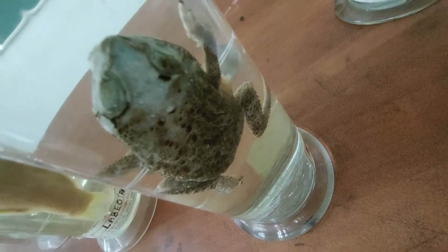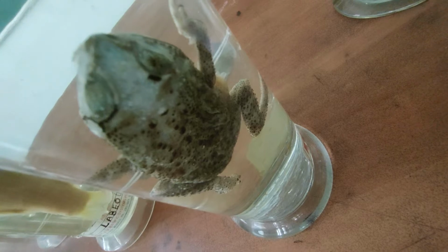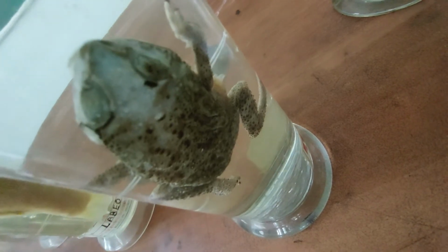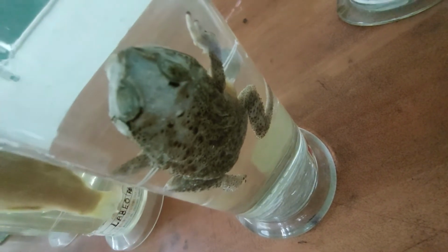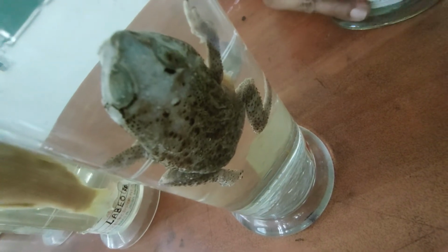So they show metamorphosis also. So this is the first class of tetrapoda, that is the amphibia. Now let's move towards the next class, that is the reptilia. Reptare means to creep or to crawl, so these are the crawling animals. The snake is an example.